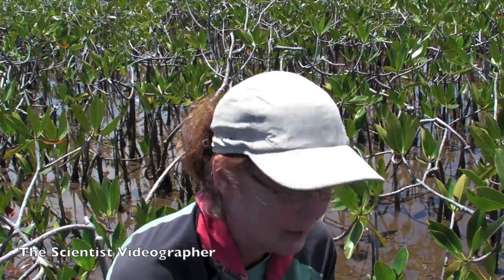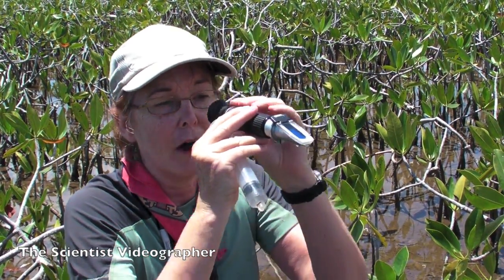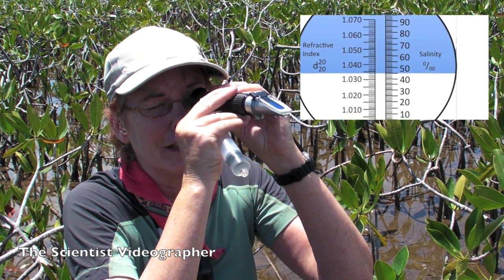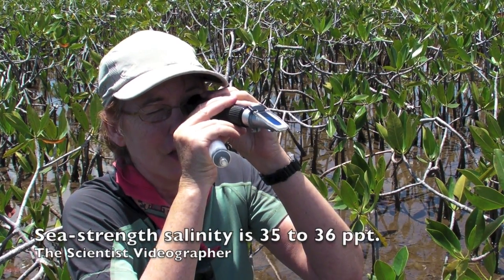and put a few drops onto the glass face and close the cover and look through the ocular. On the scale there is a line reflecting the salinity, and it reads in parts per thousand.